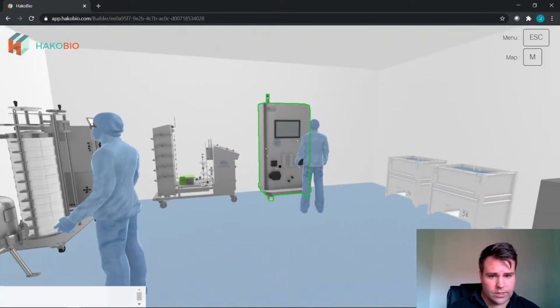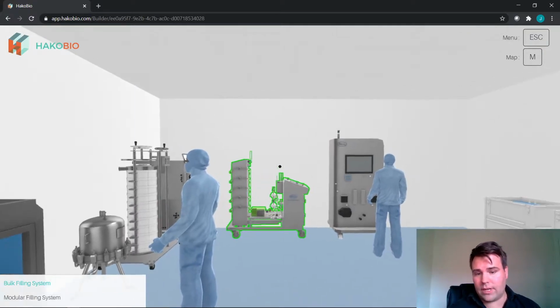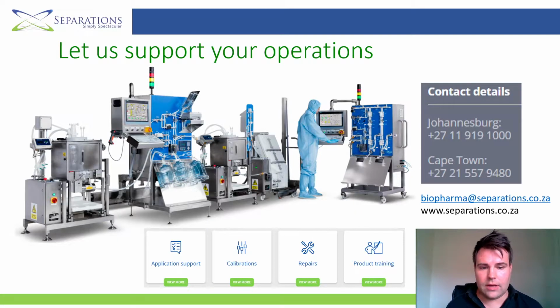So I hope you enjoyed this capabilities demonstration. Now, if you'd like additional help in these types of facility designs, I often do it for potential projects that are going to go ahead, to show the medical regulator what the facility will look like, to show potential investors what the facility will look like. It's nice because you can spatially put equipment in as it is, along with the operators.